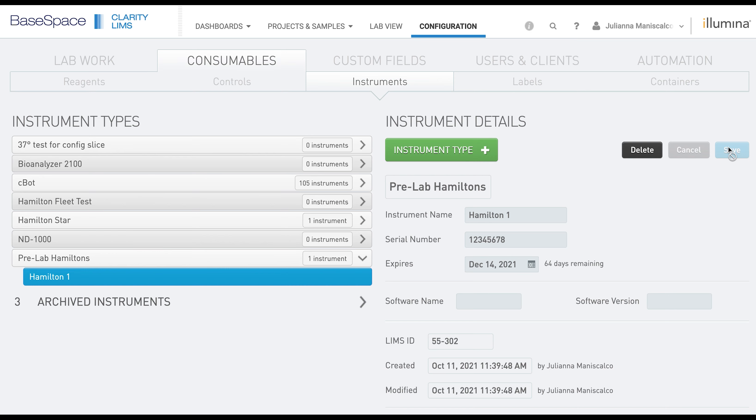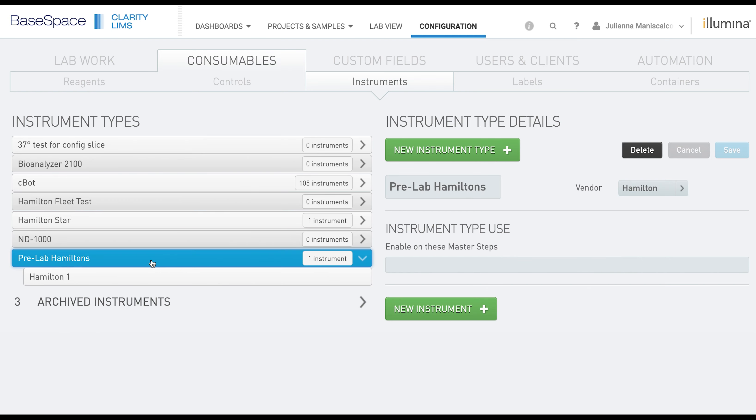To associate the instrument with the step, we will click back into the instrument type, and then under Instrument Type Use, you select which master step you would like this to be seen on.